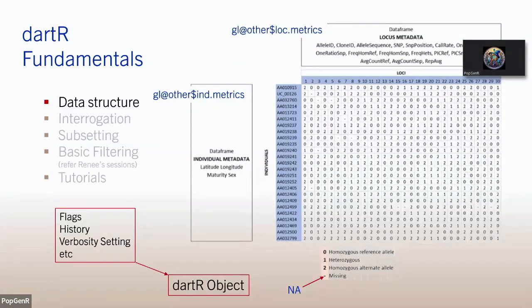Yeah, the question is, are we talking about how to access these genlight objects? And yes, I'll be talking about that in a minute. So if everyone's clear on that, you've got these genlight objects, and that's what you're accessing when you're doing your analyses.